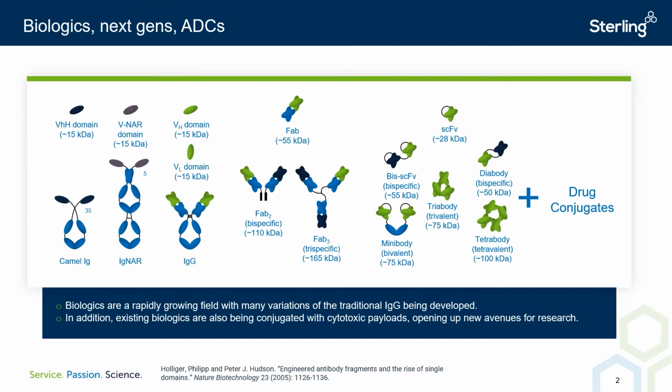And on top of all these molecules, we've got the addition of drug conjugates of various kinds coming through that add an extra level of complexity. So analyzing these can present different challenges going forward.